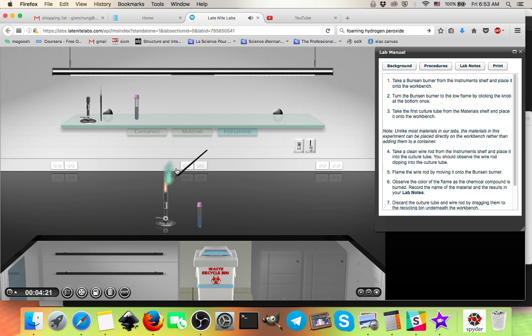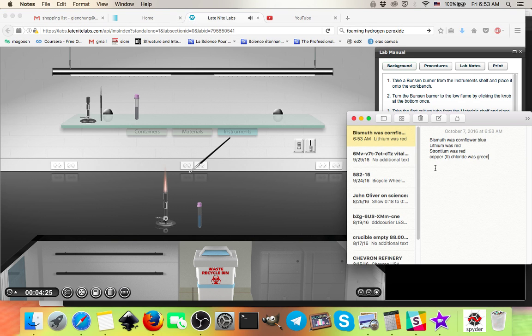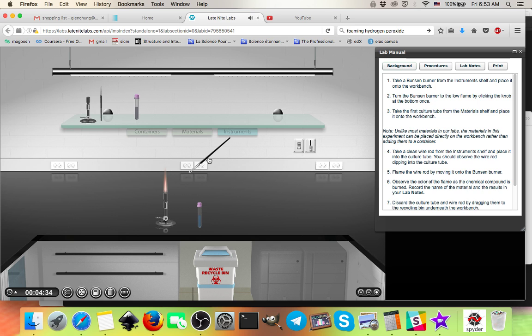I can only describe this as green. So maybe I'll type teal green in my note. Green or teal green. Okay, so that is my note, and I will proceed by throwing stuff away in the recycle bin, going to the materials list, and then finding something else.